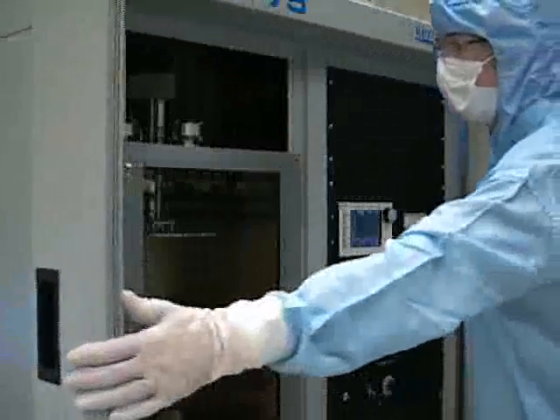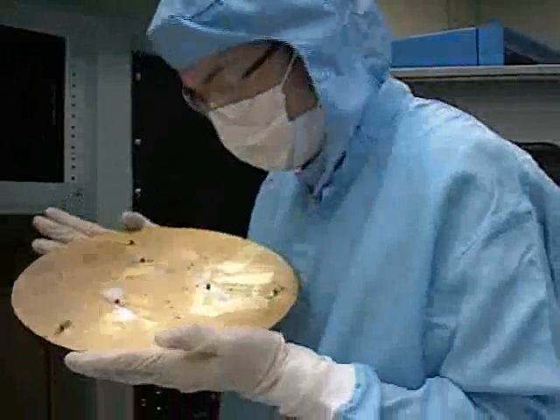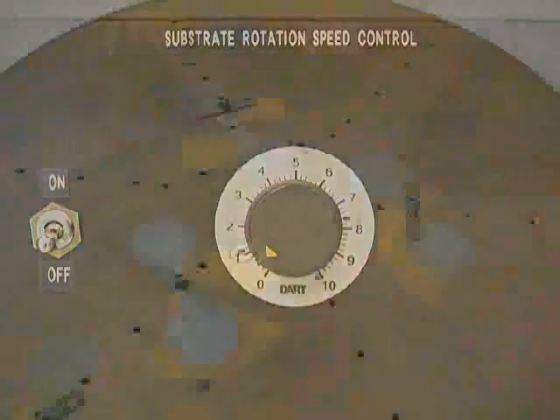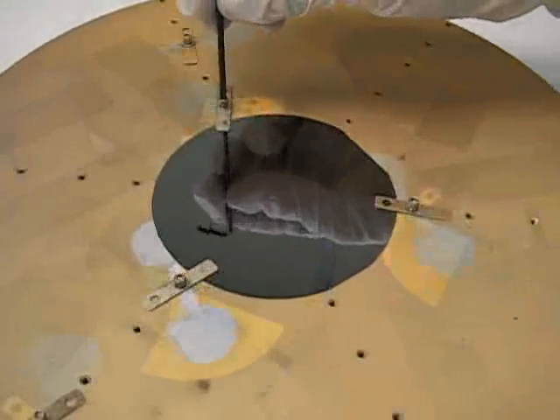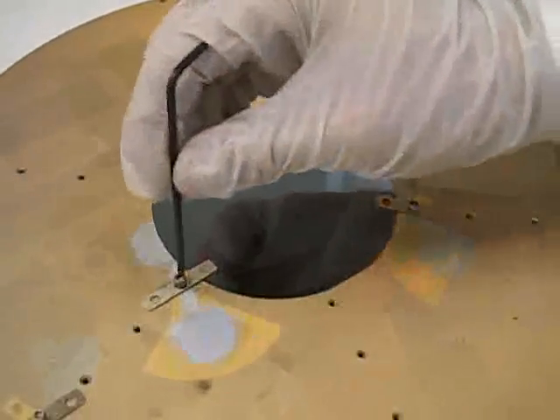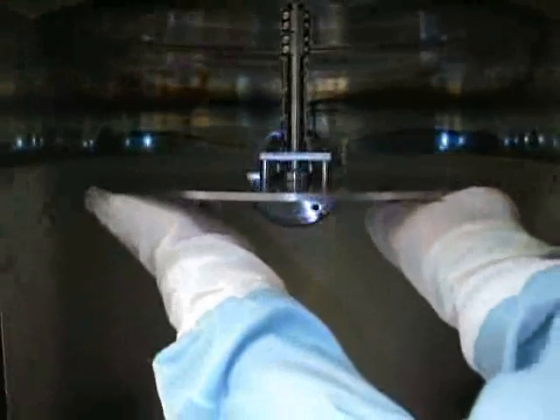At this point, you should remove the sample holder plating. This should be done by lifting the plating slightly and sliding it out over the alignment pins. You may have to rotate the plating using the substrate rotation control in order to remove it. You should now mount your sample securely to the plating using spring clips. Remember that your sample will be mounted upside-down while it is in the evaporator.